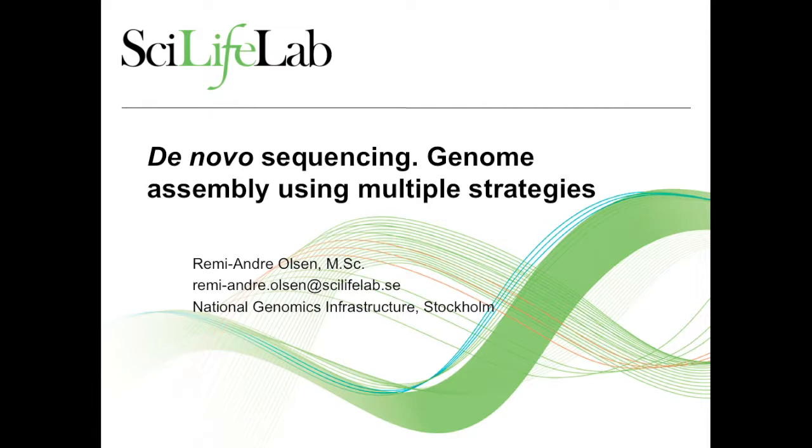So hi, my name is Remi Olsen. I'm a bioinformatician, and I work mainly with anything that is de novo sequencing. So I will give a short overview over all the multiple methods we provide here at NGI Stockholm, and also the de novo assembly service that we provide.